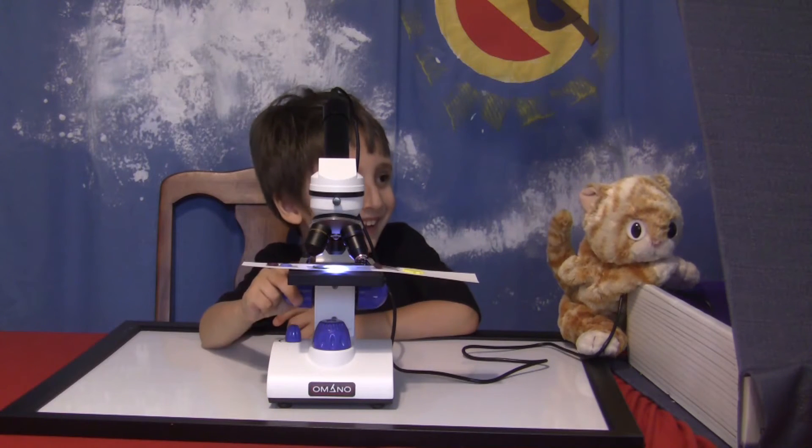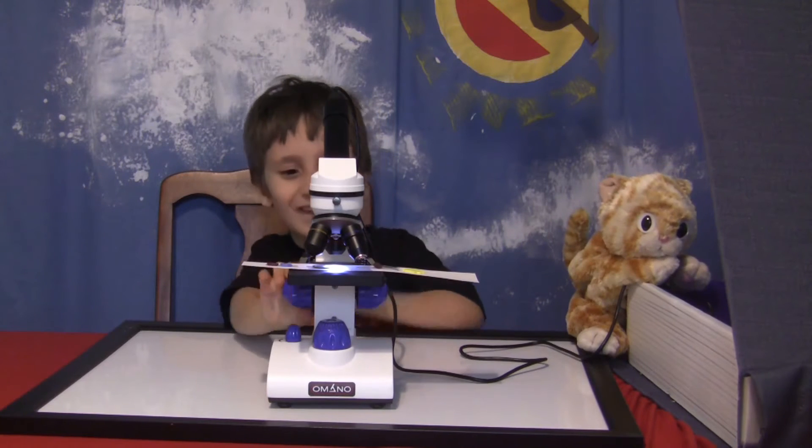Come on, come on, come on. I can't do it anymore. Look how huge that is. Let me get a picture. Wow, it's even still pretty when it's that big. It's huge. It looks like a bathroom tile.